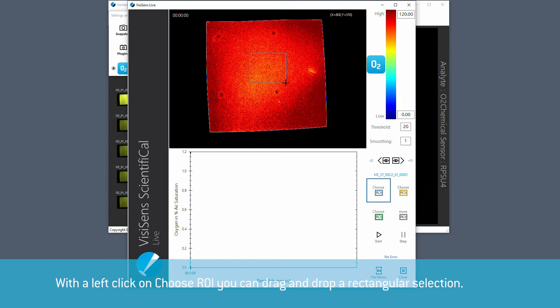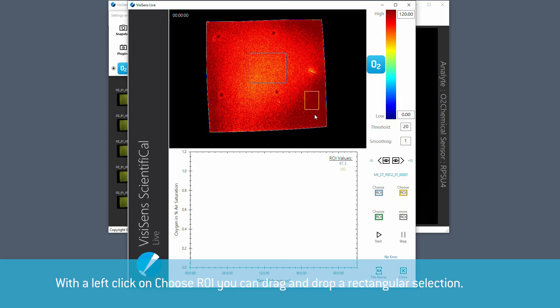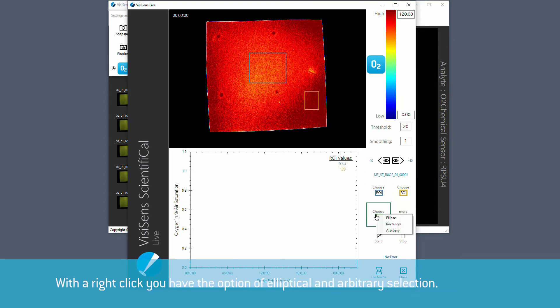With a left click on the choose ROI button you can drag and drop a rectangular selection. With a right click you also have the option to make an elliptical or arbitrary selection if required.